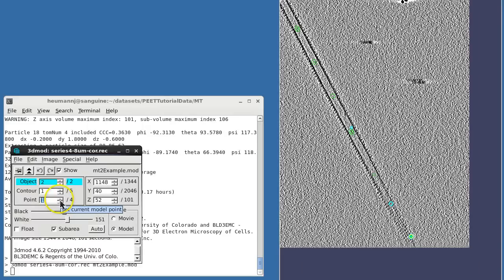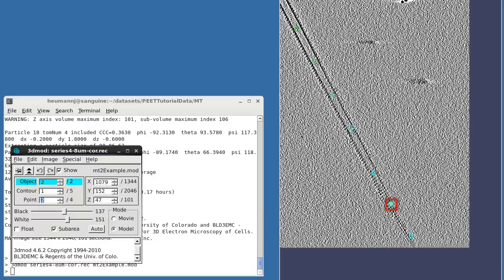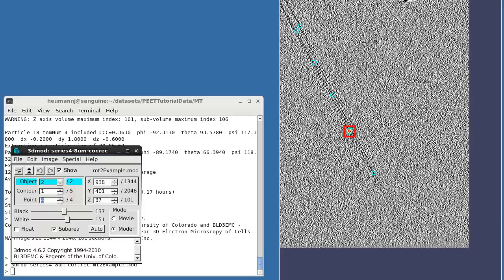If I zoom in, you can see, for example, that in Object 2, Contour 1, points 1, 2, 3, and 4 trace the path of a particular protofilament. Contour 2 traces the position of another protofilament, starting at the same axial position as the last point in Contour 1, and then so on for Contour 3 and later contours. The single point overlap between contours is required to determine the difference in rotation angle between successive protofilaments.